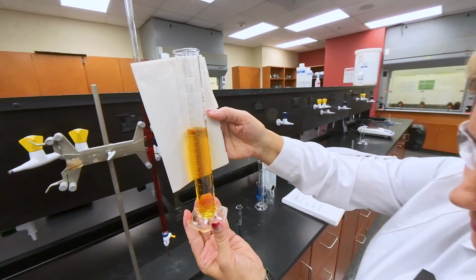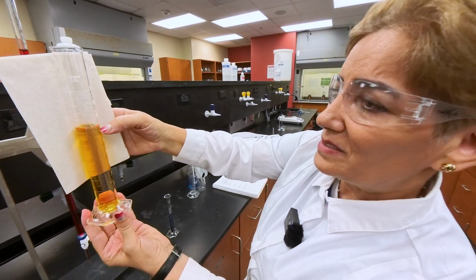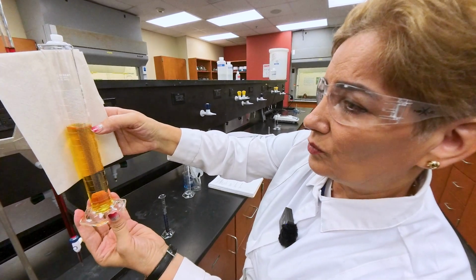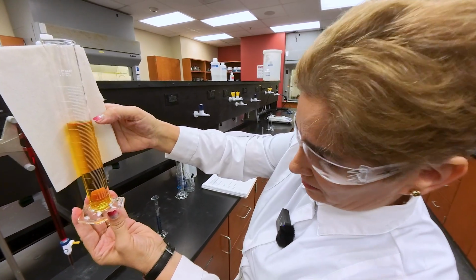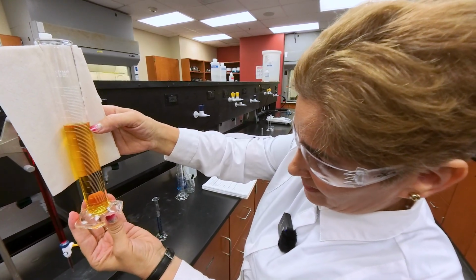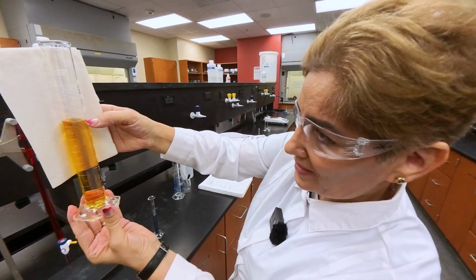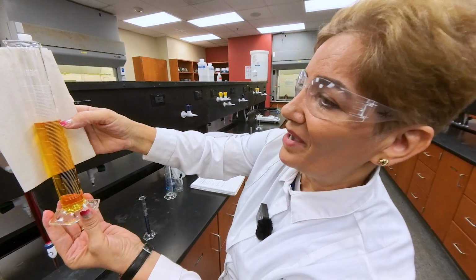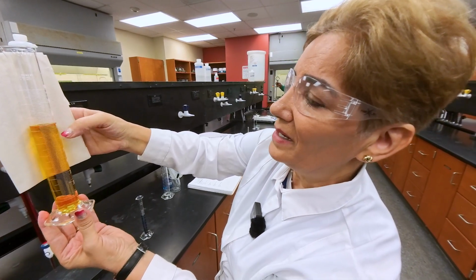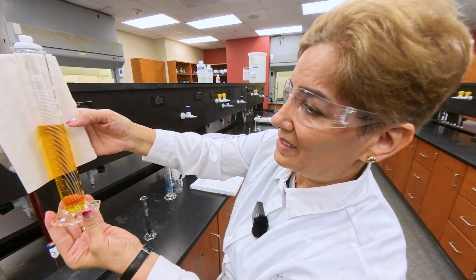I'm going to have to stop so it doesn't shake, so I can look at the number exactly. Okay, it is between 72 and 73. And now between 72 and 73, there is this small space that I have to mentally divide by 10 and estimate exactly.